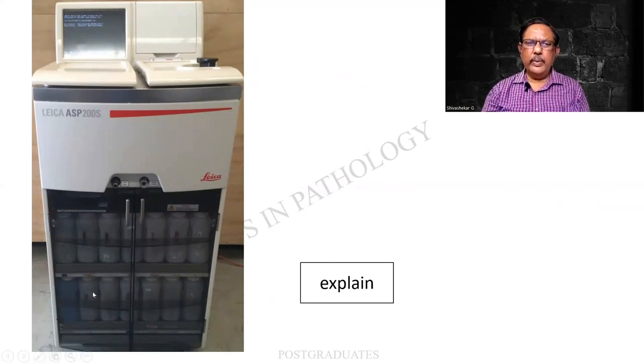Of course, these will be the various reagents in that concentration as required. There will be, for example, formalin, 10% formalin. And then there will be the ascending grades of alcohol. Then there will be the xylene, one, two, or three changes as is required. Then there will be the wax. Wax, of course, is not in this one.